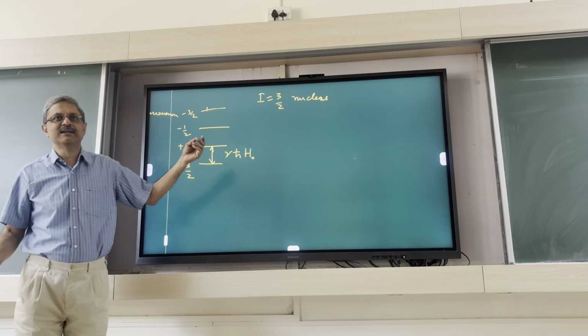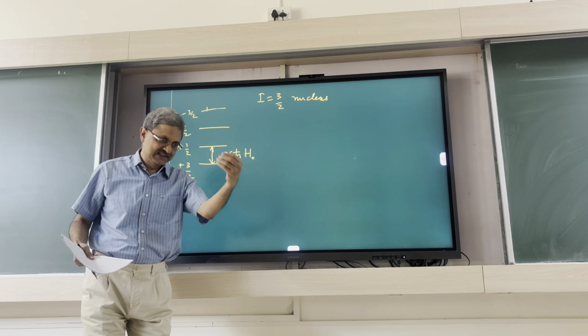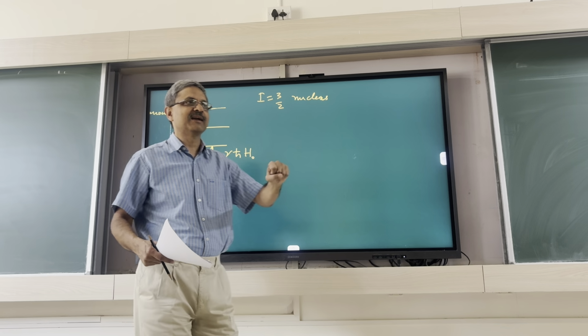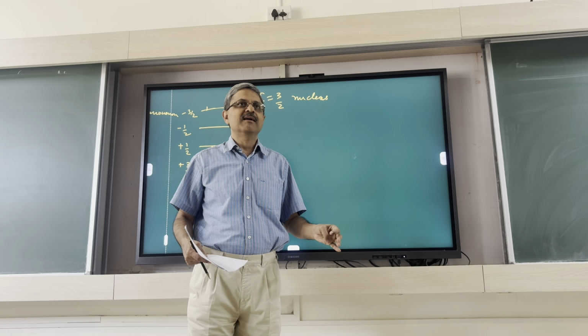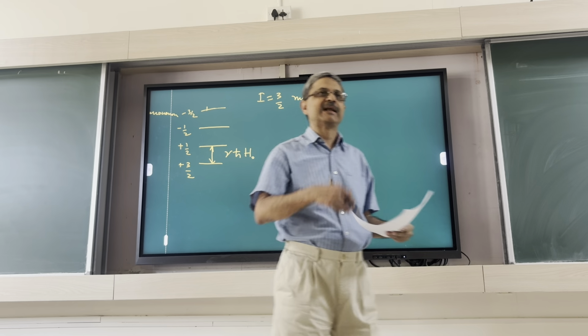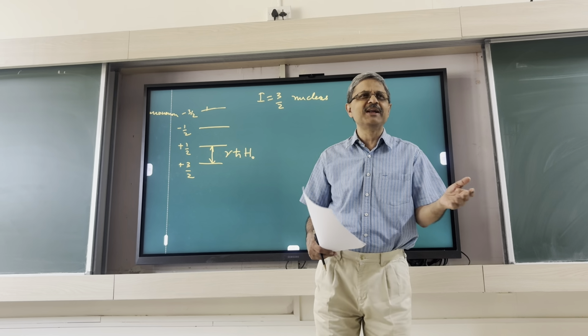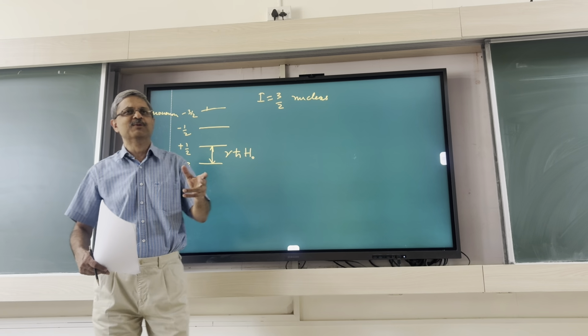This is the nuclear Zeeman effect. The moment you have a DC field, you get a splitting. Your question is maybe deeper. In actual practice, is it okay to have just 10 Gauss and do a measurement? So we'll come to that. So usually not. There are practical problems.